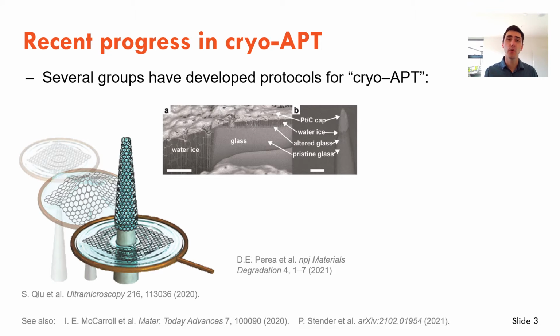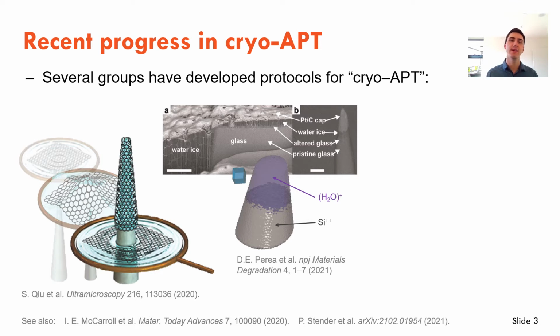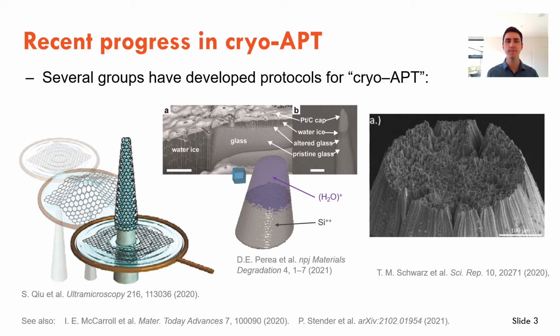The group at Pacific Northwest National Laboratory have reported on mixtures of water ice with borosilicate glass. The outermost layers of the glass are porous, with water penetrating into the pores and hydrating the glass. A sophisticated FIB lift-out procedure is used to prepare specimens for atom probe.